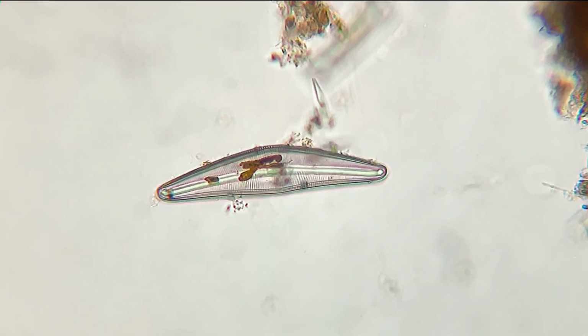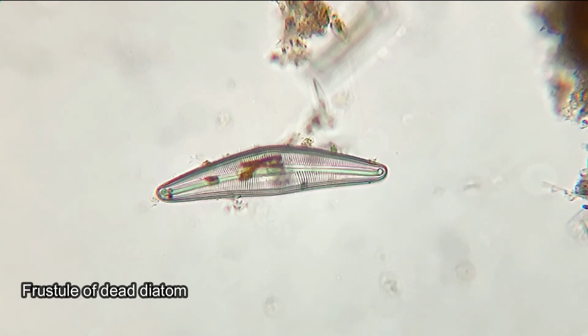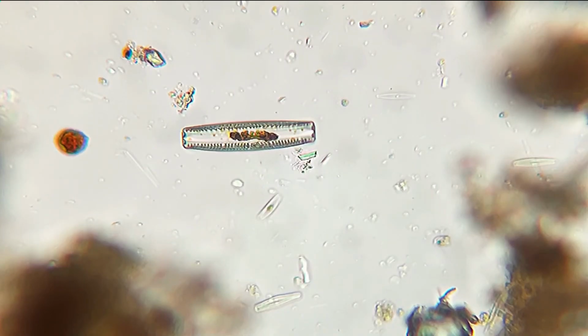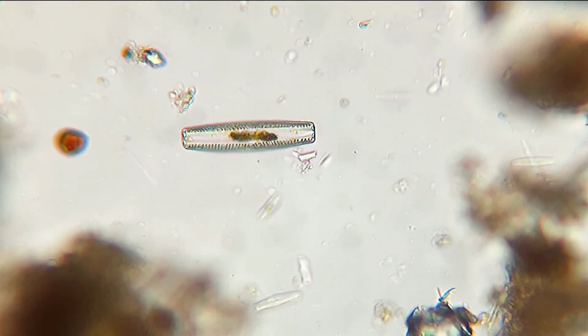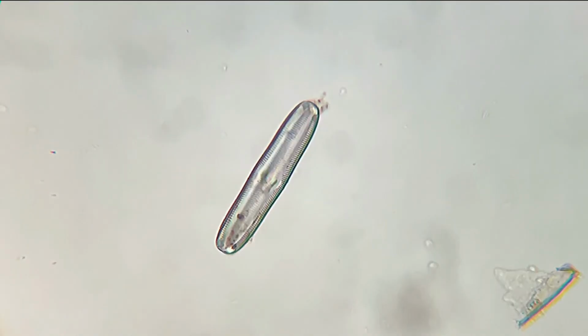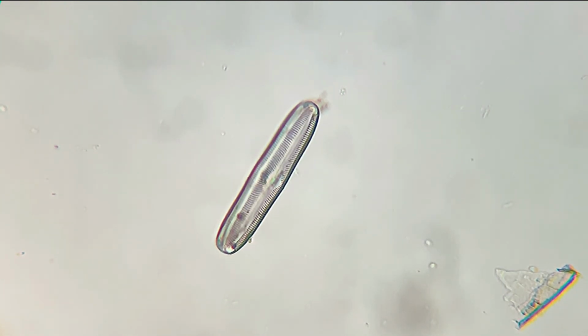What we are seeing now is a dead diatom. Because diatoms make glass cell walls, when diatoms die, their glass cell walls do not get decomposed. This is another dead diatom. Different species of diatoms produce different types of shapes in their cell walls, with different types of beautiful patterns, like this other dead diatom.